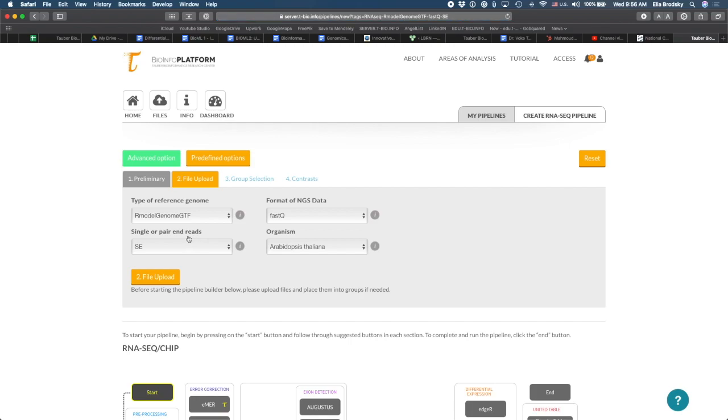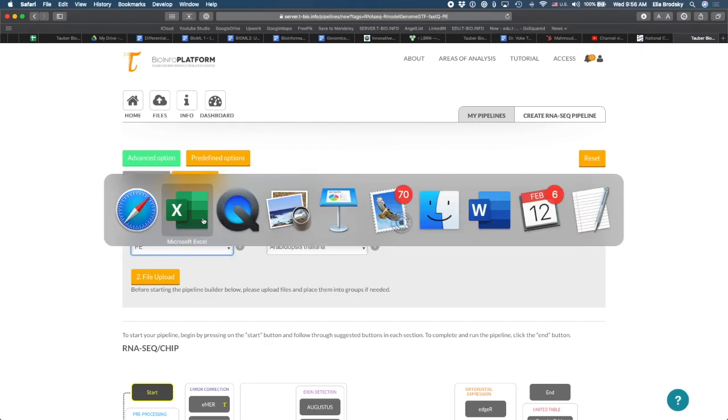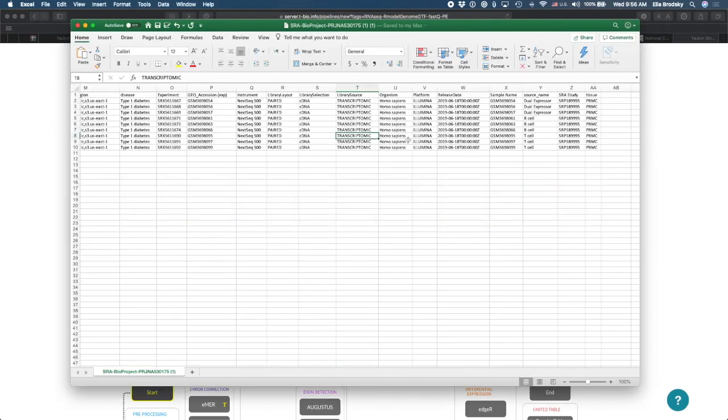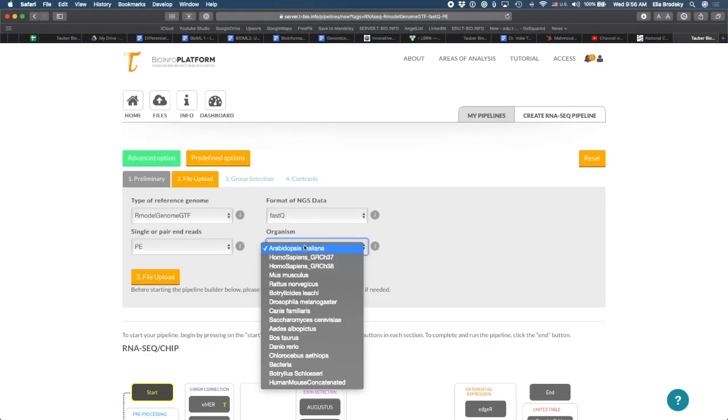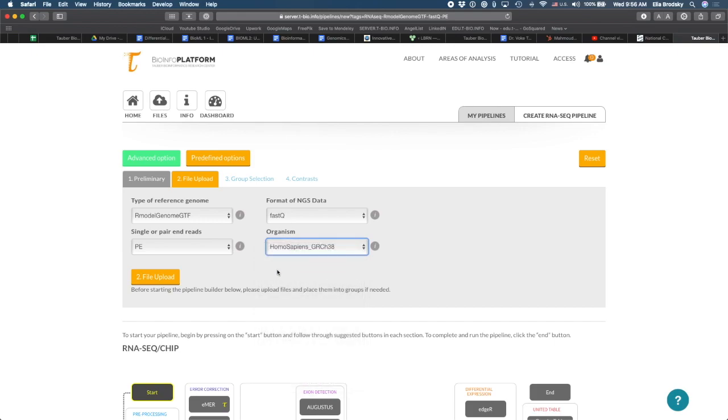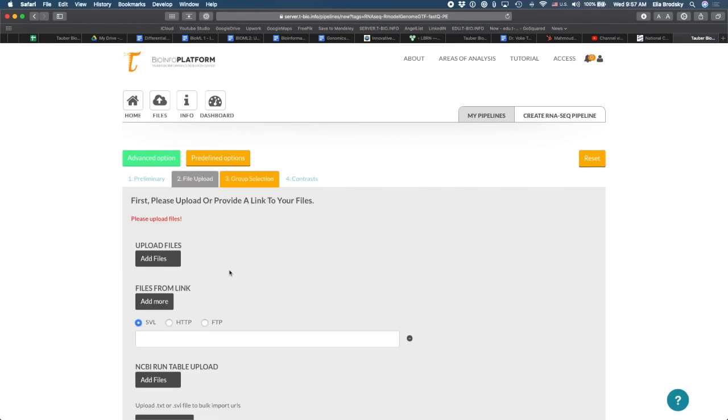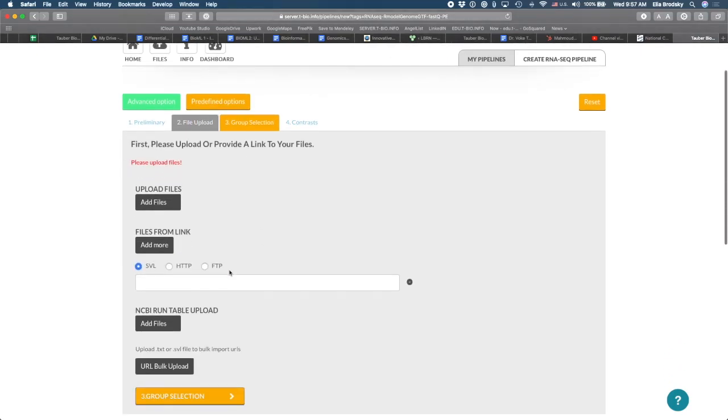Now, as you remember, I saw that this was paired end read. So I'm just going to change this to PE. If I look at what organism this was, it says right here the Homo sapiens or human. So I'm going to find here the latest assembly of the human genome, which is GRCH38, and click on file upload.